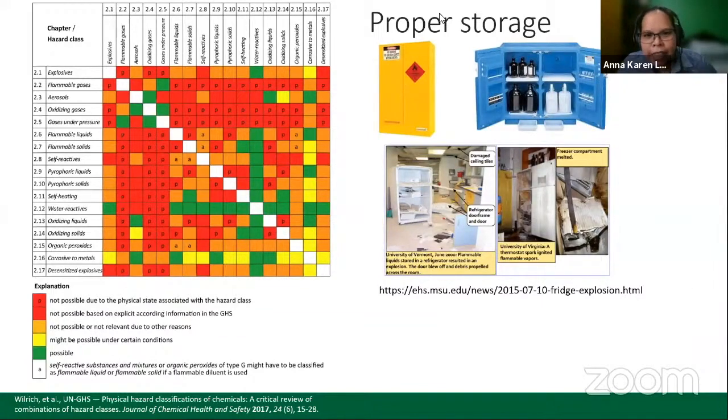So can I just ask, for example, acetic acid. Acetic acid is both an acid and a flammable. Where will you store acetic acid? Together with the flammables or together with the corrosives, the acids? What do you think for acetic acid? Corrosives, okay? Together with corrosives, okay? So a lot of you answered corrosives.